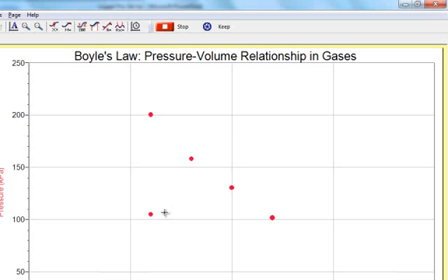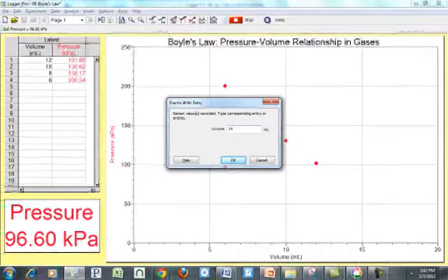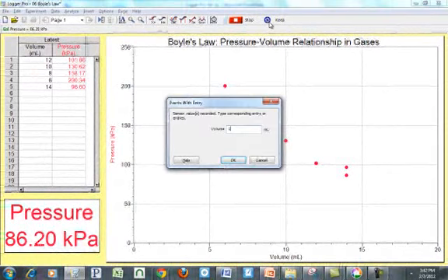And now I want to go the other way. I want to pull the plunger out to 14. I hit Keep when I'm at 14. And then I come back out to 16. I hit Keep. I've got 16.